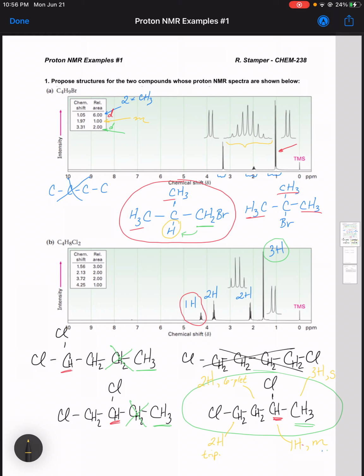And so that could be the end of the story, right? Now, what I want to look at here is what's going on with that CH2 group. So remember, this is the not quite shifted one, or not seriously shifted one. That's going to be this guy here.